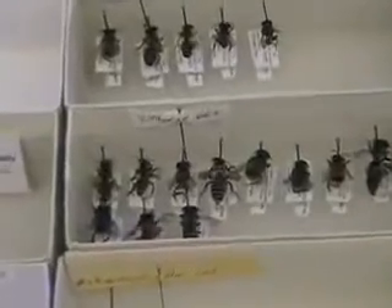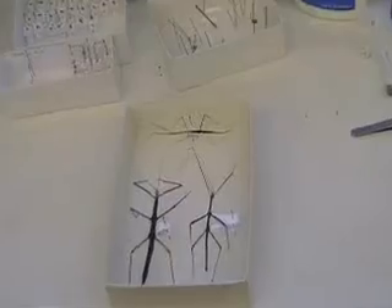We're going to talk about how to properly pin insects. There are many different ways of pinning insects, and there are many different types of insects, and each insect has to be pinned a certain way.